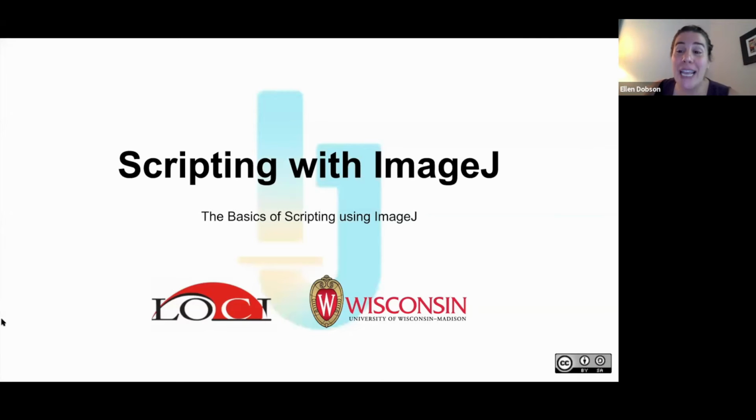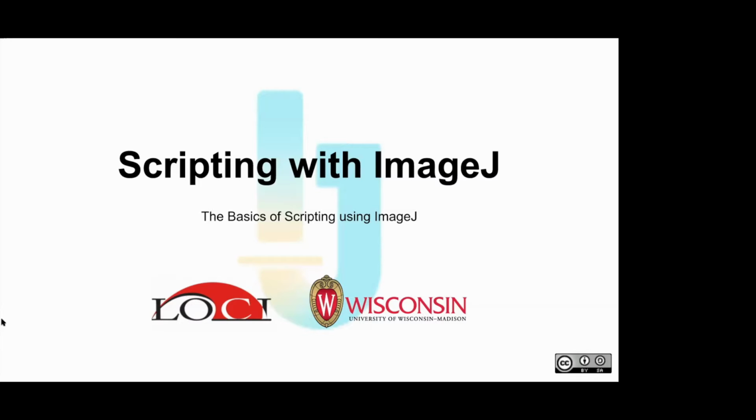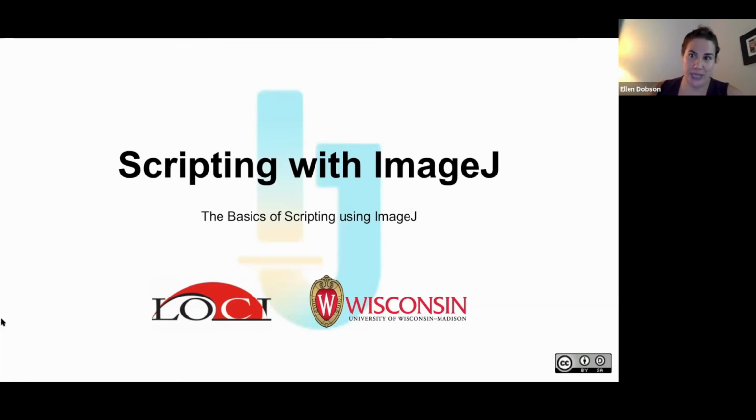But again, it all depends. That's why each protocol is different; it depends on your data and what you're trying to measure. All these protocols, these pipelines that you build, are very specific for what you're doing. But overall, these are the general tools that are applied. Okay, thank you.